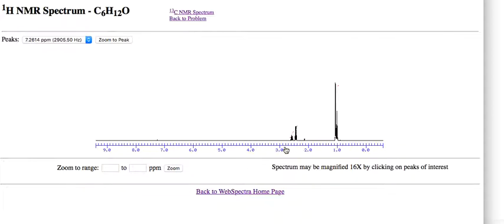So an isopropyl group would have 3 carbons, an ethyl group would have 2 carbons, and that's 5, but we have a 6th doing something. And the isopropyl group is CH3, CH, CH3. Okay, so that is 7 total. And the ethyl group is CH2, CH3, 5 total. So the hydrogens are all taken care of, but we don't have a carbon dealt with and we don't have an oxygen dealt with in this spectrum. And we're not really sure where the double bond is unless it's between the carbon and the oxygen. And that's what I'm going to propose here.